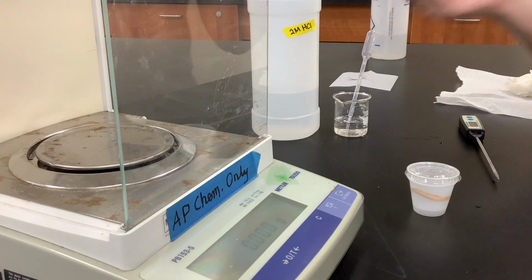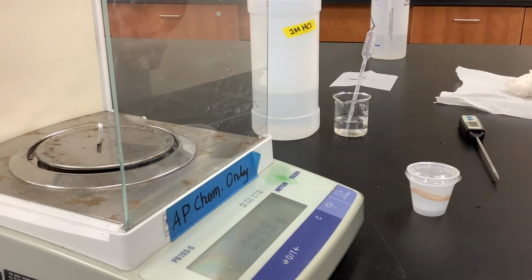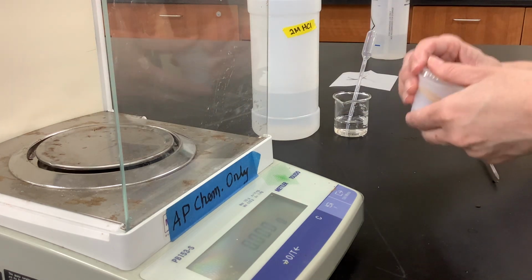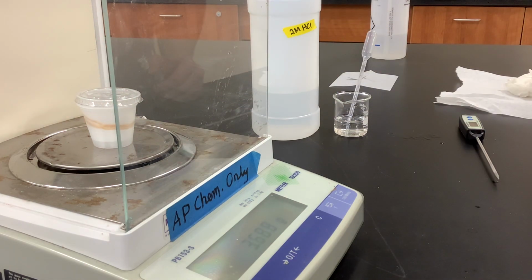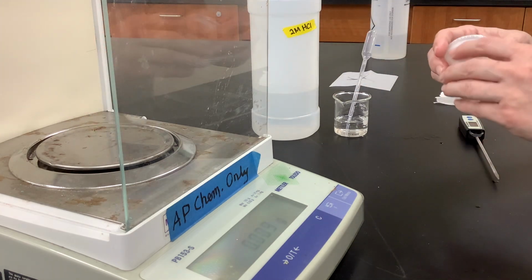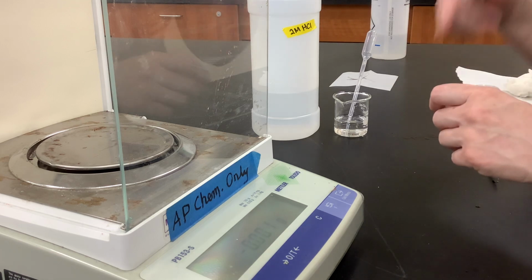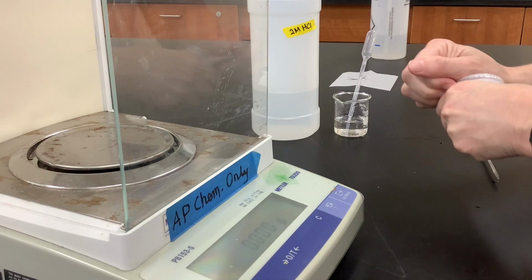Okay, so trial number 2, okay, magnesium, and take the mass of the magnesium. Okay, so this is 0.065 grams. Okay, set that aside. Take the mass of our calorimeter. Okay, so 3.688 is the mass. Okay, and you guys should maybe be thinking about why we would want to take the mass of the calorimeter between each trial. Kind of brainstorm that as we're working through things.